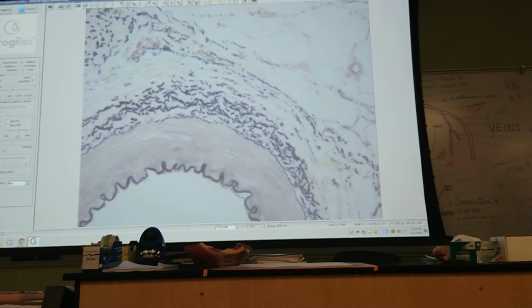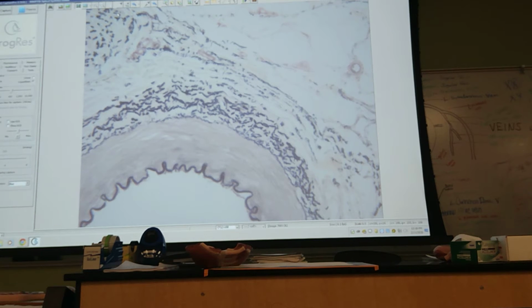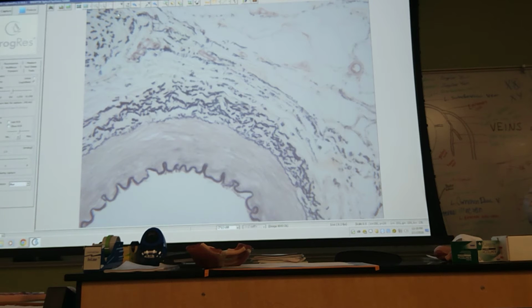We'll talk all about that in lecture, in a coming chapter, as to why you have this design. Again, the old cliche, which does work: structure and function follow each other. So here's another example of that. If you like that artery, we'll go to the vein.